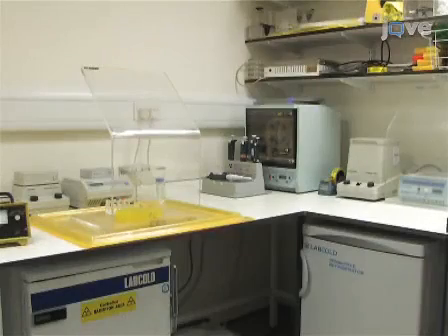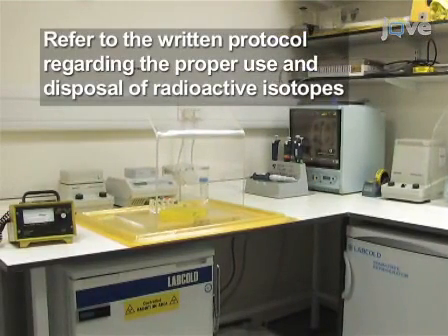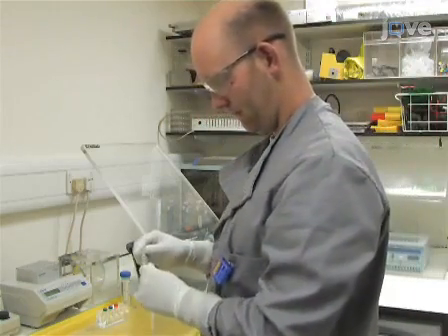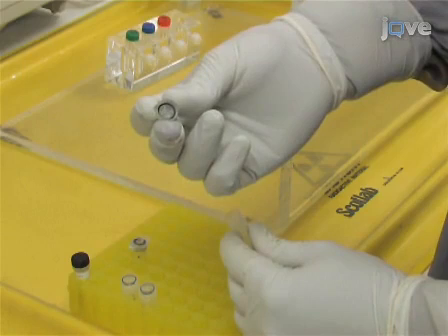Before beginning this procedure, refer to the written protocol regarding the proper use and disposal of radioactive isotopes. To prevent the spread of radioactivity, prepare all reaction mixtures in 1.5ml sample tubes with screw caps containing an O-ring.